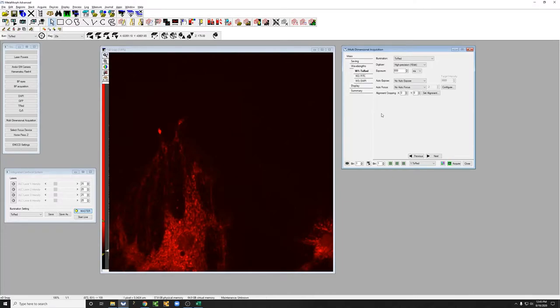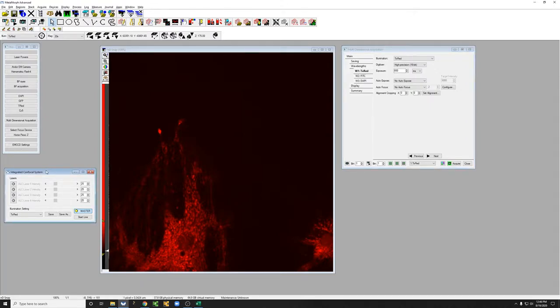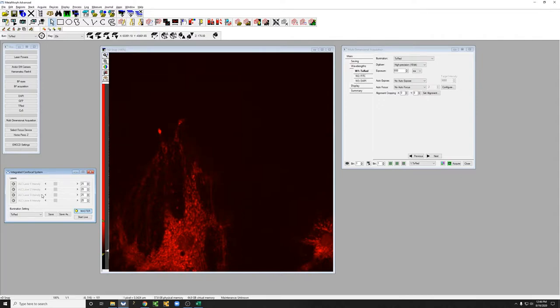In addition to the camera settings, another thing you can do is adjust the laser power using this window here. These unfortunately don't have the names of the lasers, but they're ordered from lower to higher wavelengths. So the first one is the laser for DAPI, the second one is for FITC, the third one is for Texas Red, and the last one is for PSY-5.